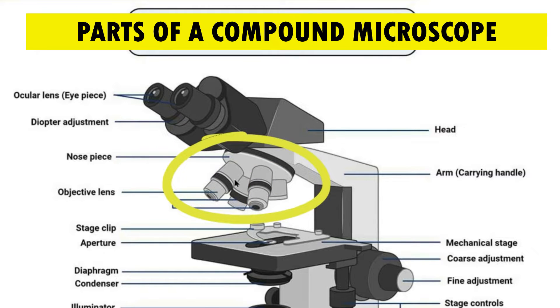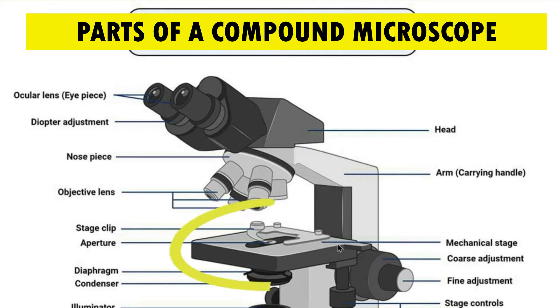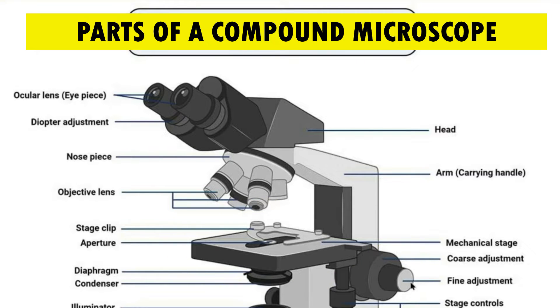These objective lenses are of different magnifying powers and they help in magnifying the image of the object. This is the stage on which stage clips are there, which help in fixing the slide on the stage properly. Pay attention to these knobs — coarse adjustment and fine adjustment. They help in focusing. By simply rotating these, we can get a clear image.